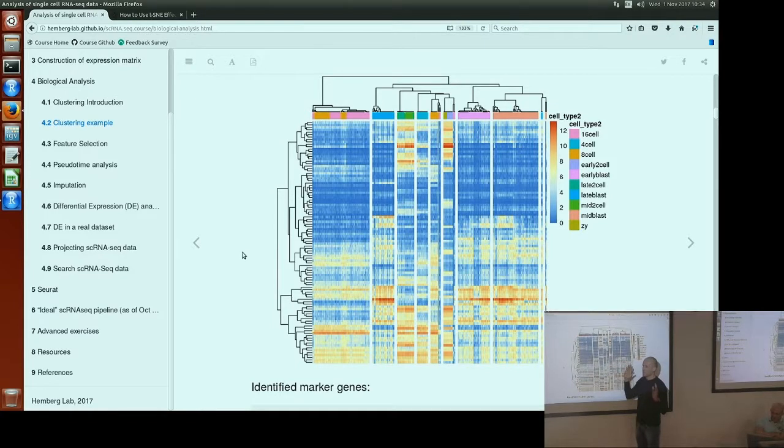It doesn't have any meaning, it just puts genes into 100 groups. And then you visualize. It'll always be a different combination of genes, yes, if you run it multiple times. But you don't see the gene names here anyway, so you're not interested in the gene names. You want to see why SC3 separated your clusters into different groups.